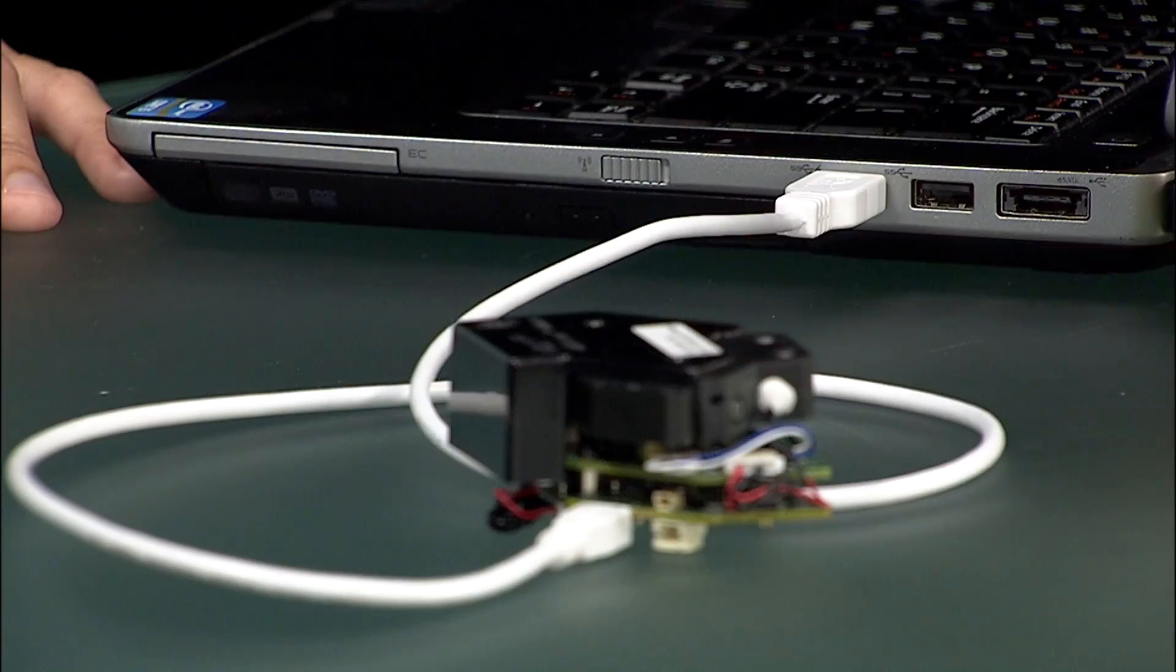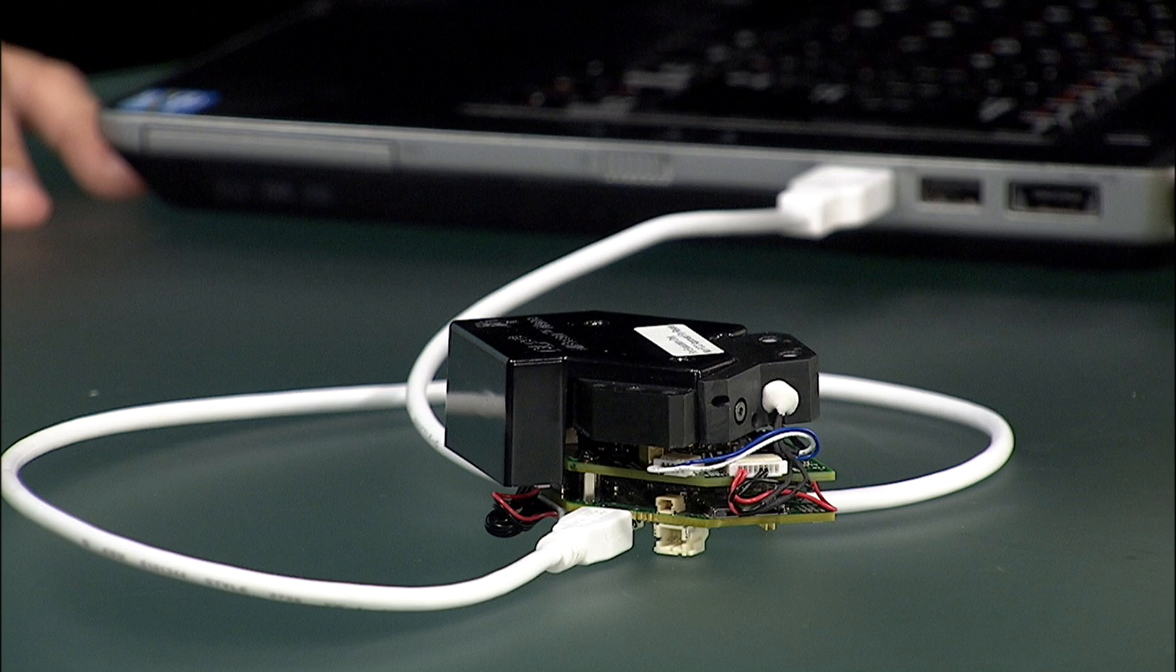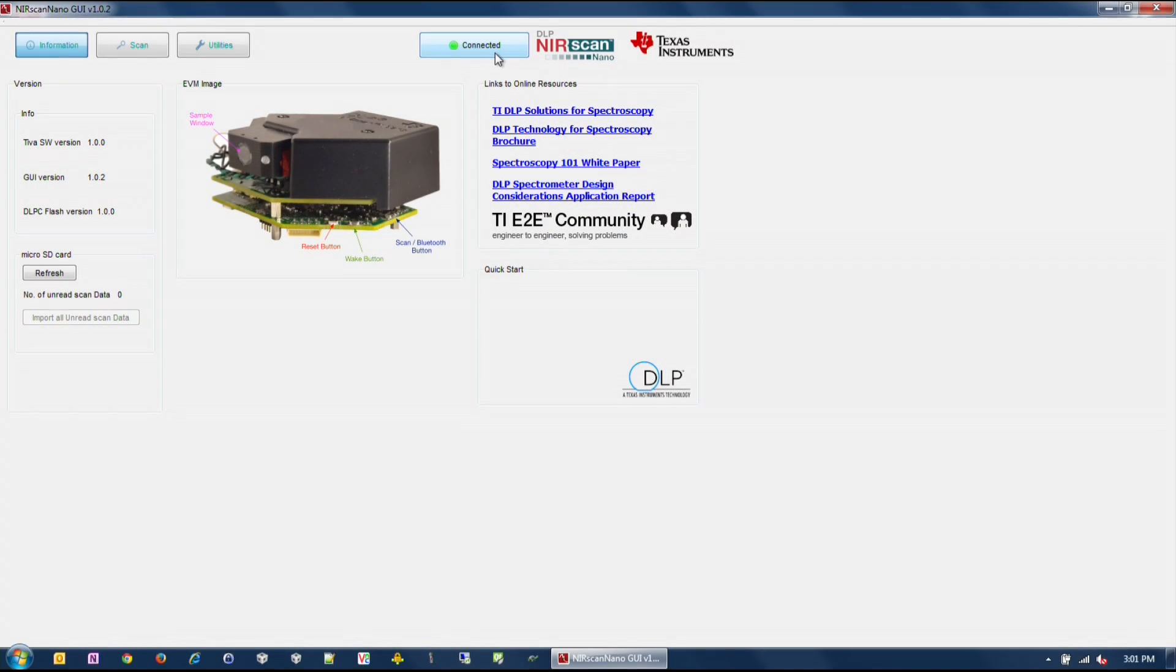The DLP Nearscan Nano supports three operating modes: USB connection, Bluetooth connection, and standalone mode. For USB connection, power the device through the USB port on your computer and use the GUI to initiate scans, configure parameter settings, and download data. The PC GUI displays the intensity or absorbance of the scan.